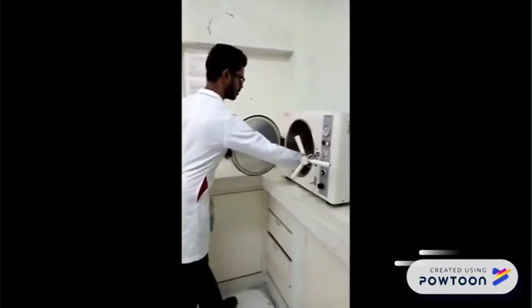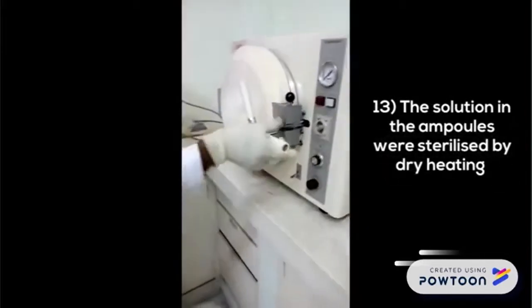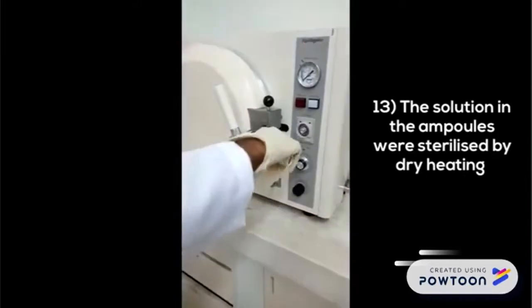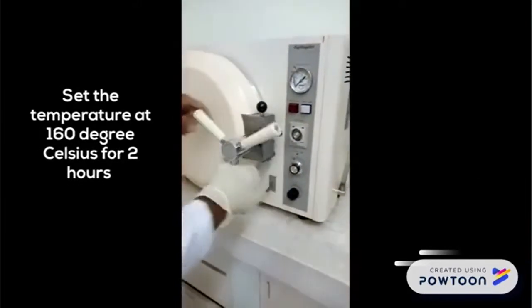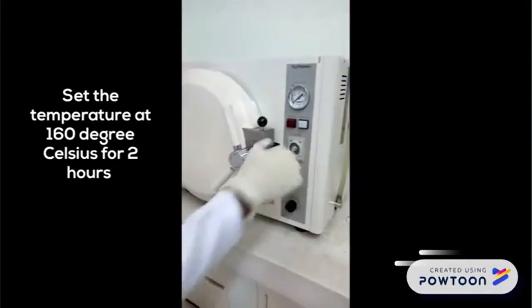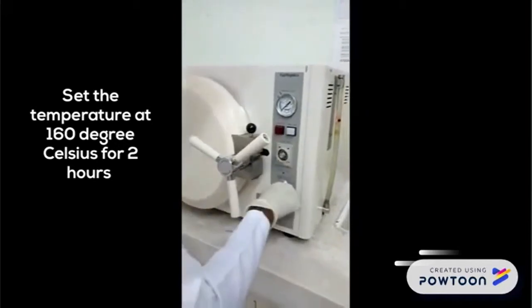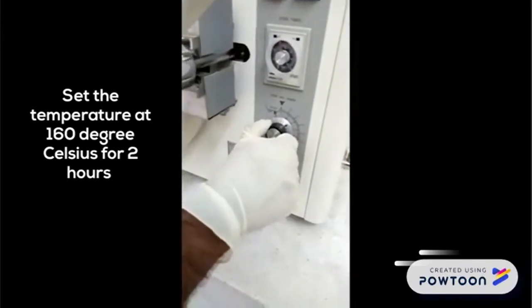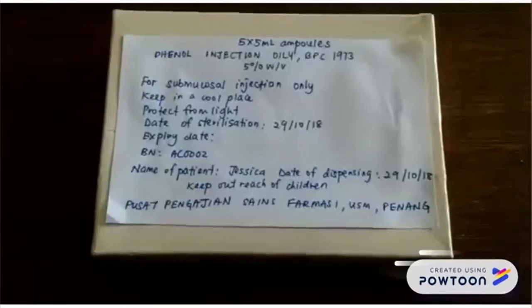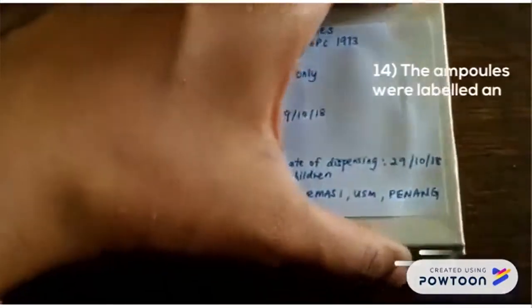For the final step, the solution in the ampoules was sterilized by dry heat. The temperature was set at 160 degrees Celsius for two hours. The ampoules were then labeled and packed in a box, which was also labeled accordingly.